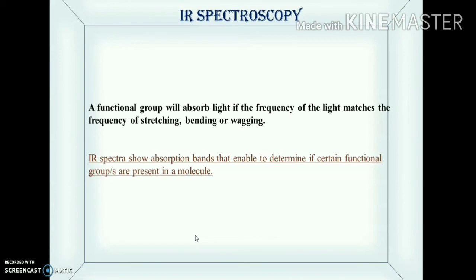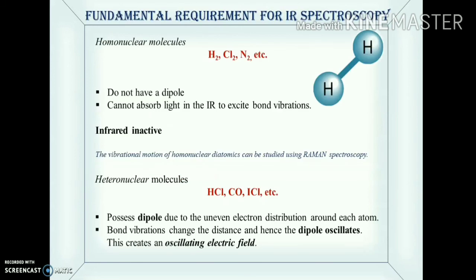Right, so after achieving these 2 points from the discussion so far, we then move forward, coming to another landmark, which is actually the eligibility criteria of any molecule to be studied using an IR spectrometer or IR spectroscopy technique. In other words, let us now try to understand what is the fundamental requirement for IR spectroscopy.